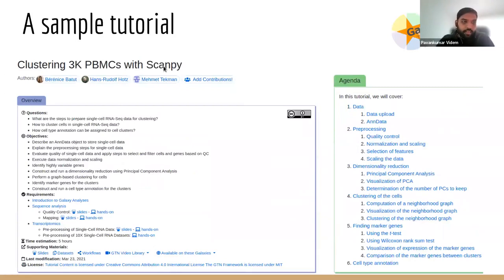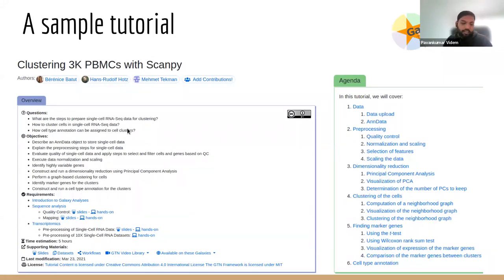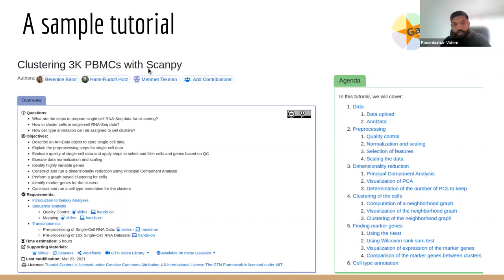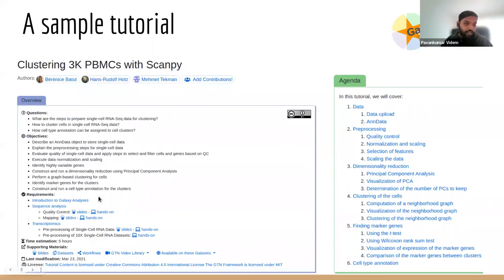This is the single-cell RNA sequencing tutorial for clustering of PBMCs with ScanPy. Each tutorial is designed thoroughly so that it can be used for self-studying, and they are often centered around scientific stories. For example, this one is about clustering of PBMCs, which is a well-known workflow implemented in ScanPy. We actually reproduce this complete workflow on Galaxy.